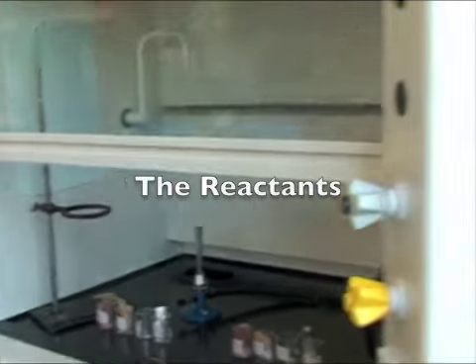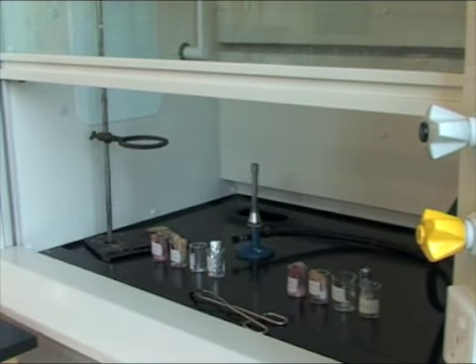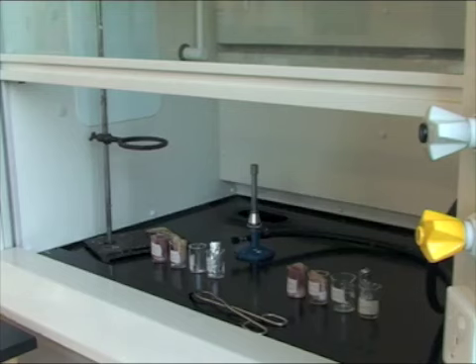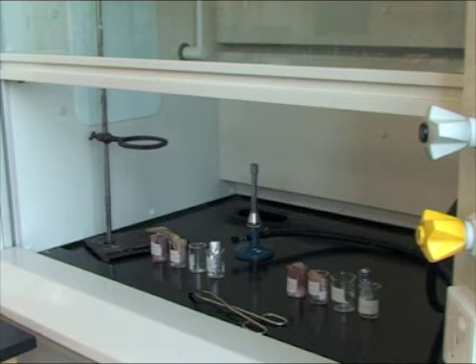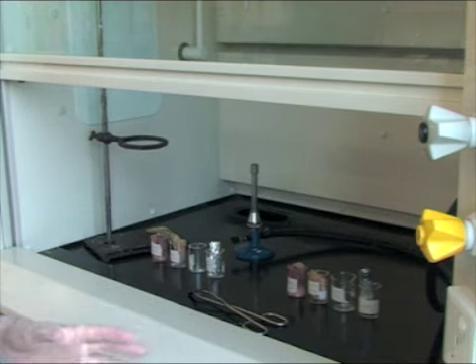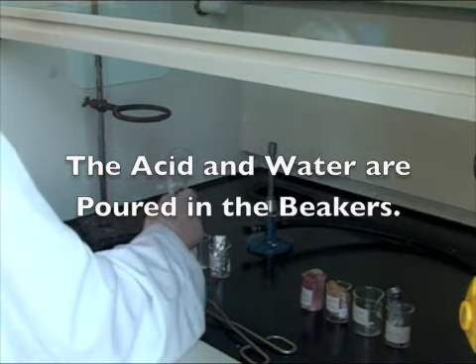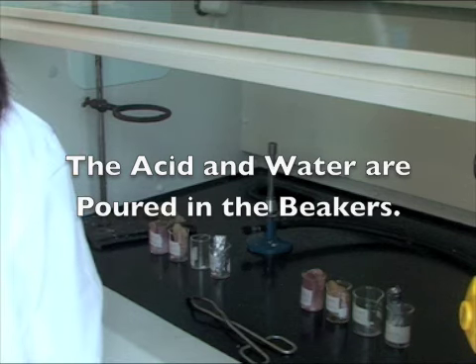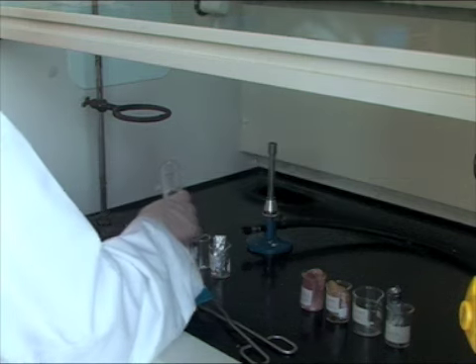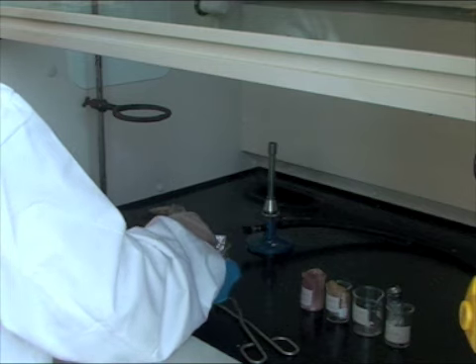We set up our lab so we could easily take observations. The materials that would react with the sulfuric acid were placed on the left. The materials that we would pour distilled water into are placed on the right. On both sides, pork is on the left, then fish, then limestone or CaCO3, and finally aluminum foil.